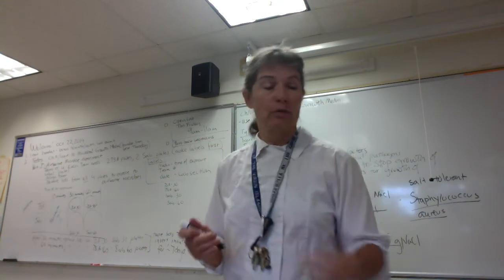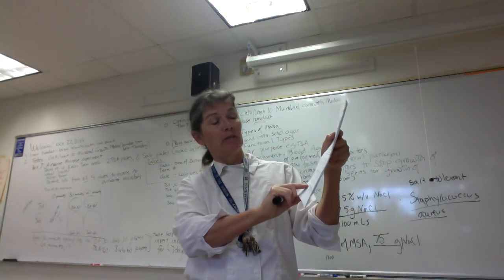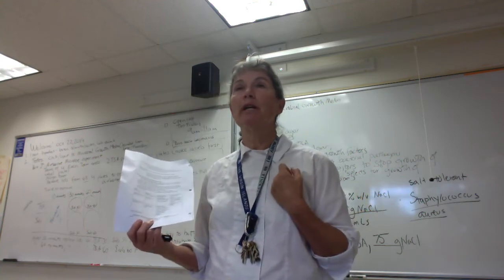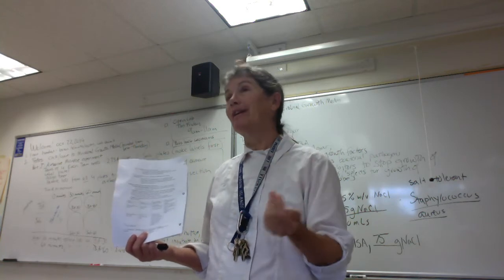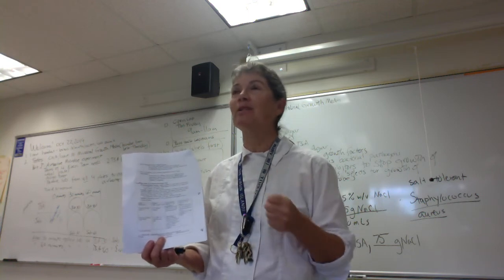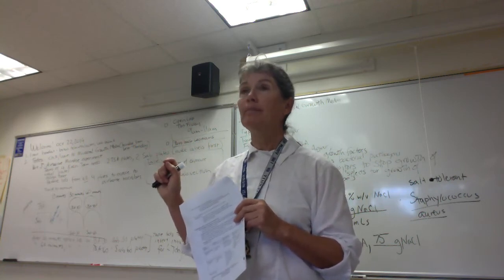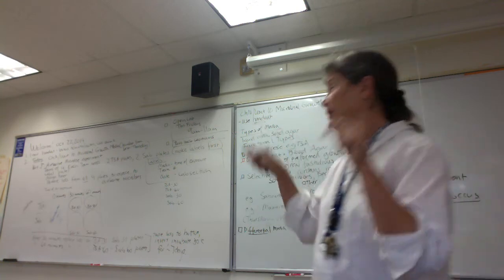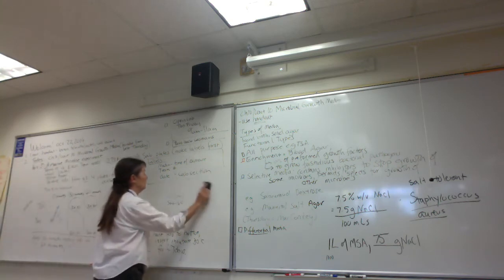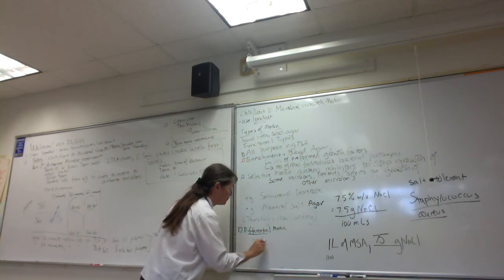So differential media, folks, let me see where Audrey has that. Yeah, okay, so you guys, if we keep going down to the bottom of page 2, it says they're differential. So differential media lets us distinguish between different groups of microbes that are growing on a particular medium. I love differential media because it'll change appearance after incubation, and I'm just totally entertained by that. So the example we're going to use today, folks, is going to be the blood agar. And blood agar is differential based on a phenomenon called hemolysis.